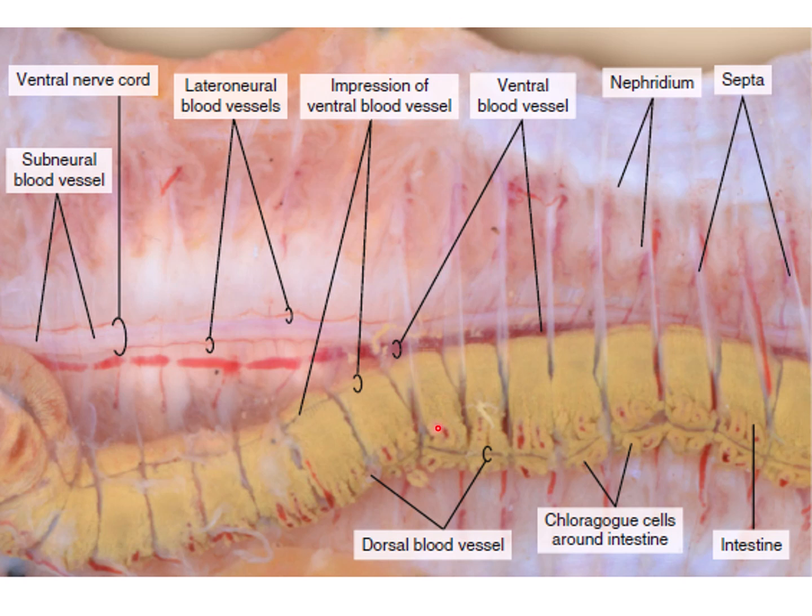We cannot see any respiratory organs, no gills or lungs, as they are not present. So earthworms do not have any respiratory system. Gases are exchanged between the circulatory system and the environment through the moist skin.